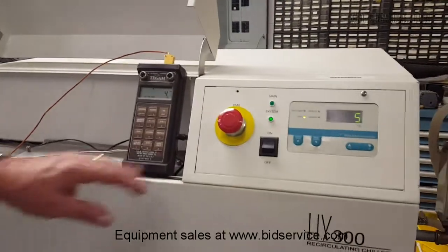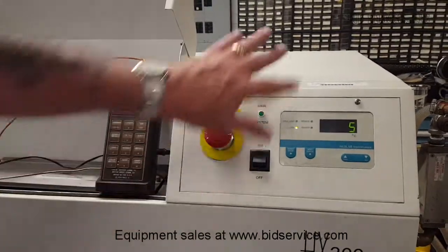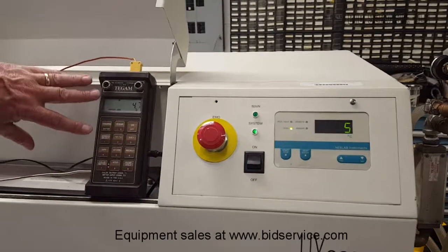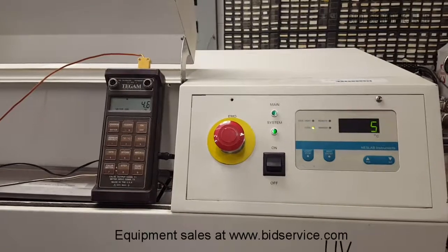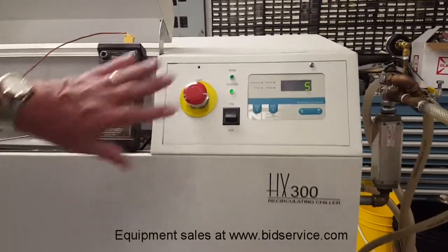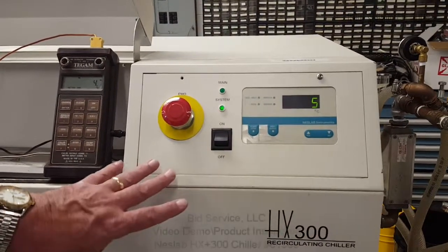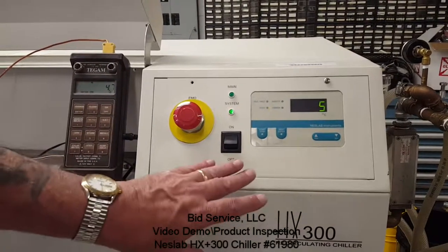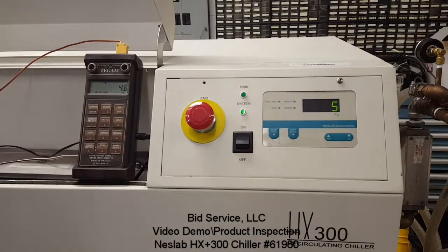It is about 20 minutes later and you can see we are down to 5 degrees and we are cycling here with the cool. Our standalone meter here is showing 4.7 degrees. I also wanted to point out that with that change from 35 down to 5, I did do a speed check and it has got about a 2.3 degrees centigrade per minute rate drop.